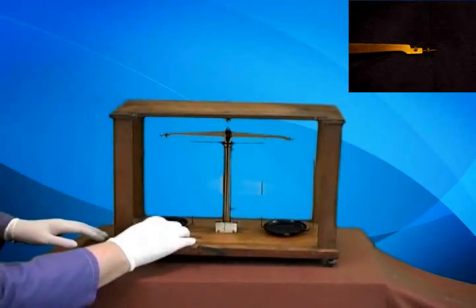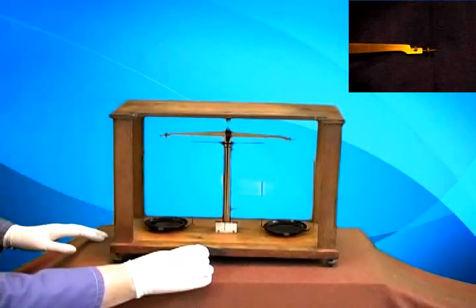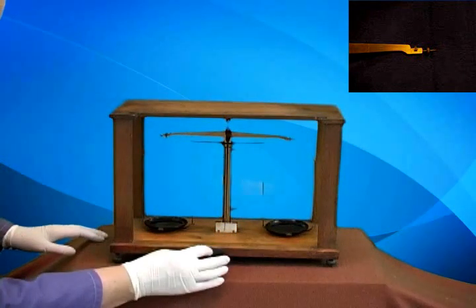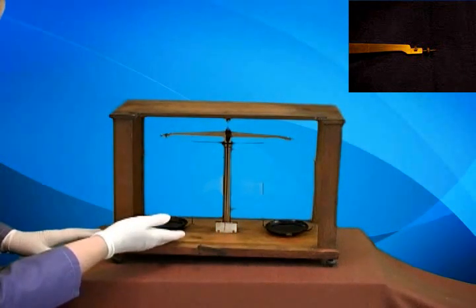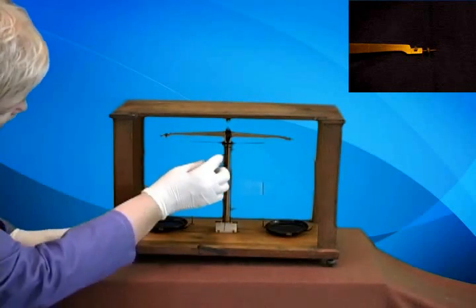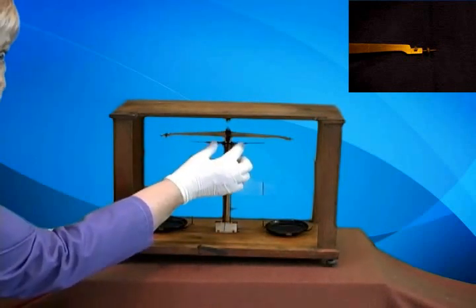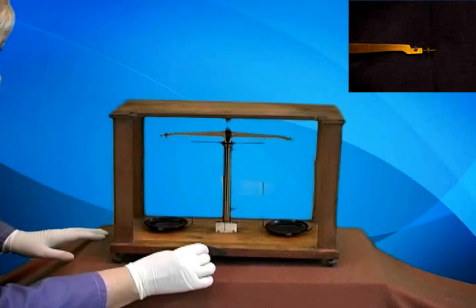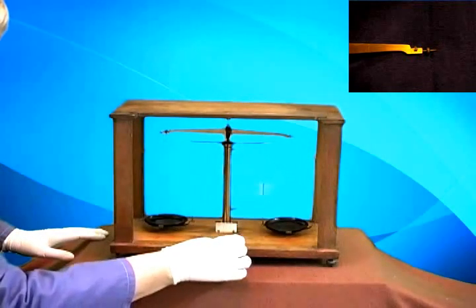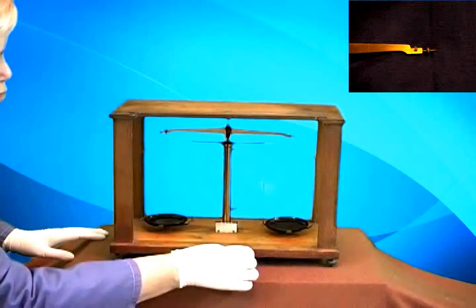Now, how did they keep the pans from swinging? They used a dampening device right here. And this dampening device allowed the pans to sit on the bottom. And then when they were ready to weigh, they would lift the beam right here by moving this lever. Watch that beam come up. And then the pans would be free to swing.